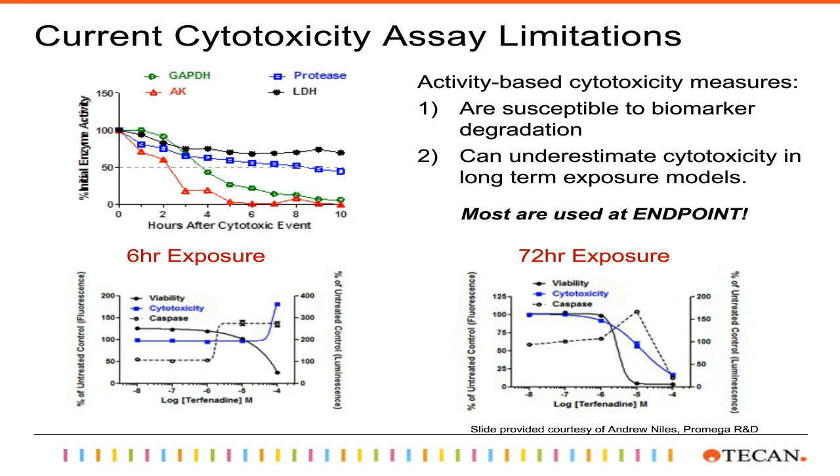So if you concentrate your focus on the top of our graph here, we're showing a comparison of four biomarkers here, showing that they all have a half-life at various points in time. But you'll notice that regardless of the biomarker that we're showing here, they have a degradation associated with them. So their half-life and their kinetics of degradation might be different, but they all do degrade.